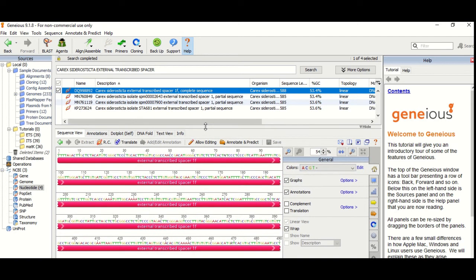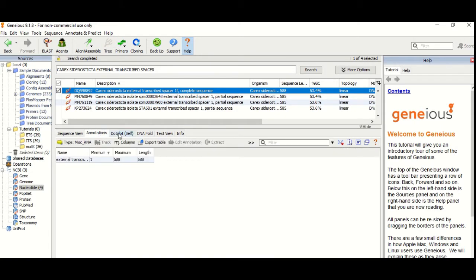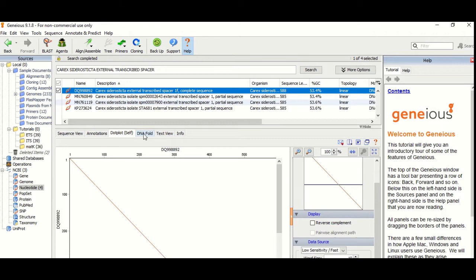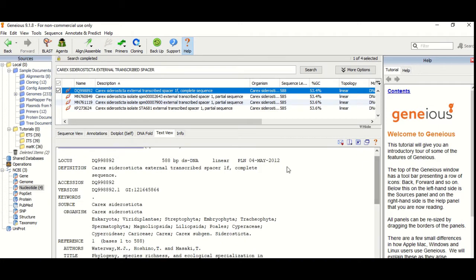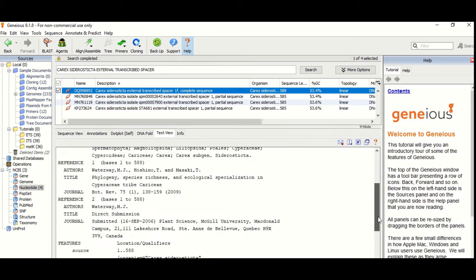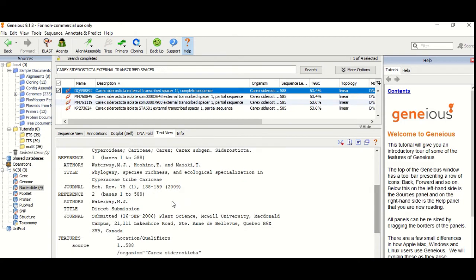Let's check the information available in NCBI. There is a sequence view, an annotation view, and a text view. There is also information about which paper, which year, and which authors — complete information available in NCBI. The paper can also be opened directly.